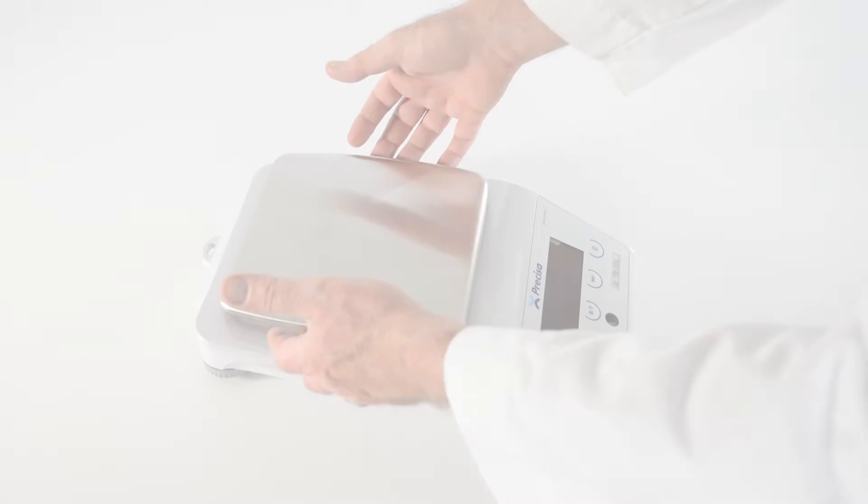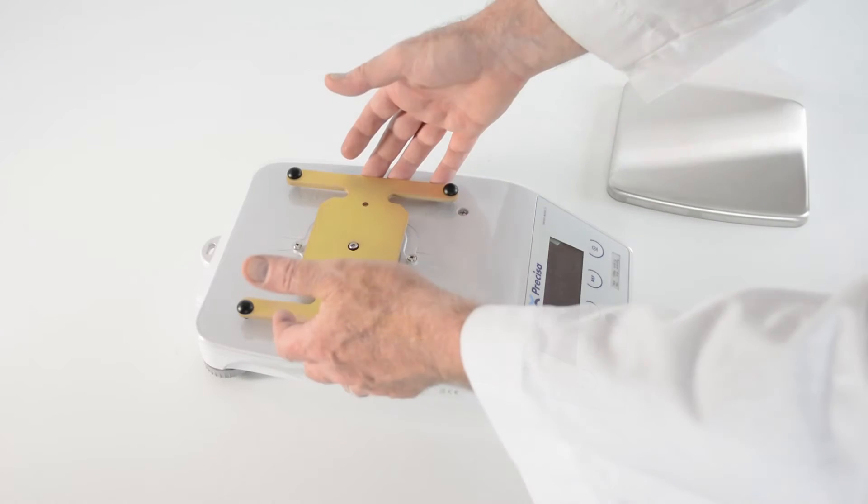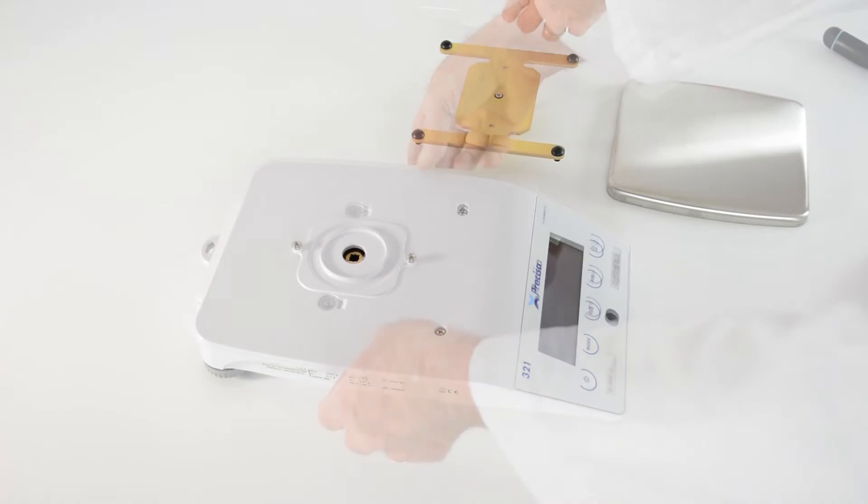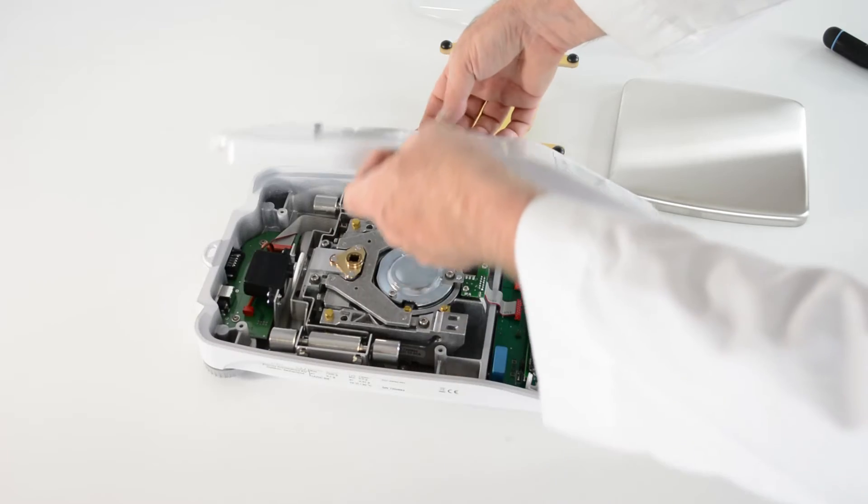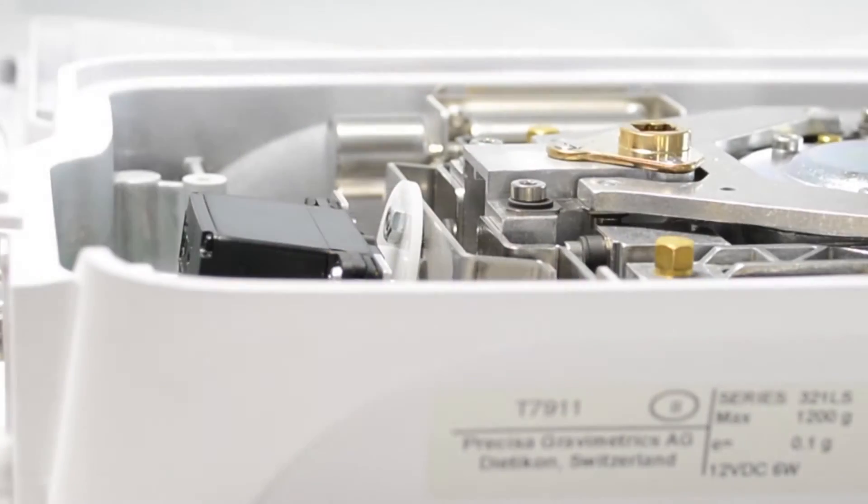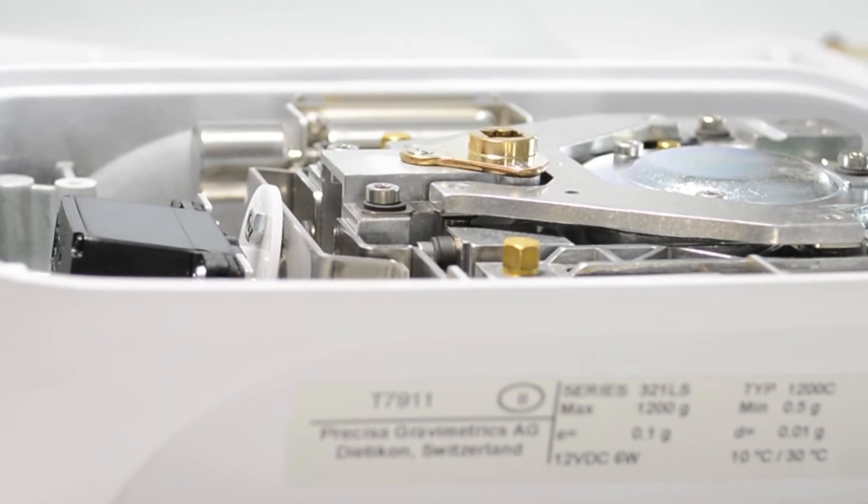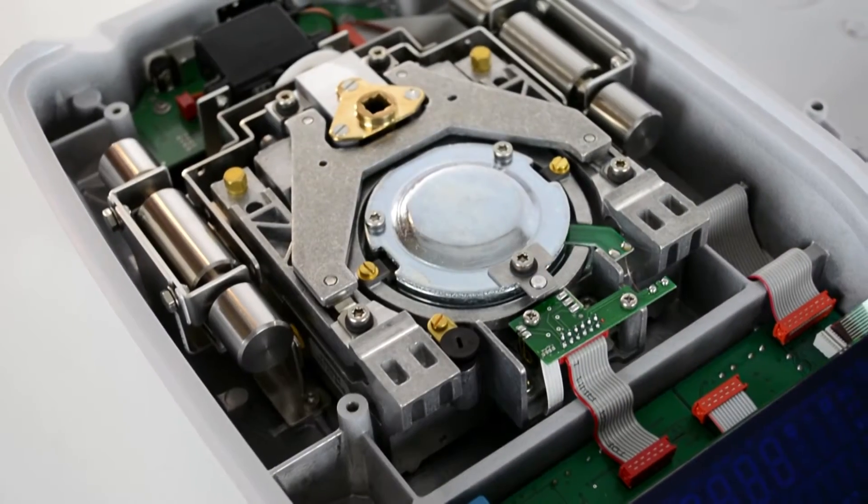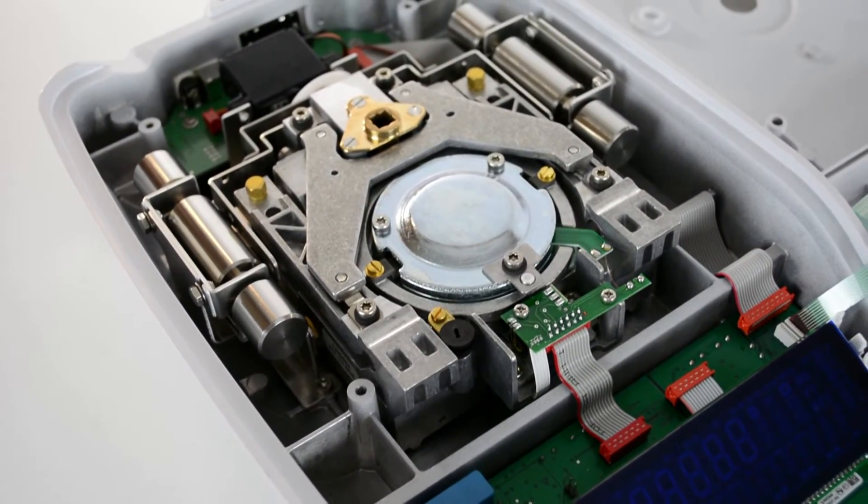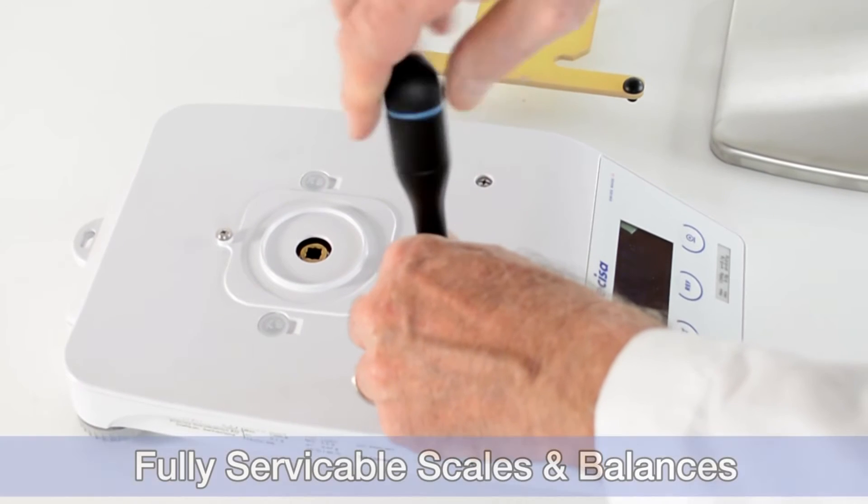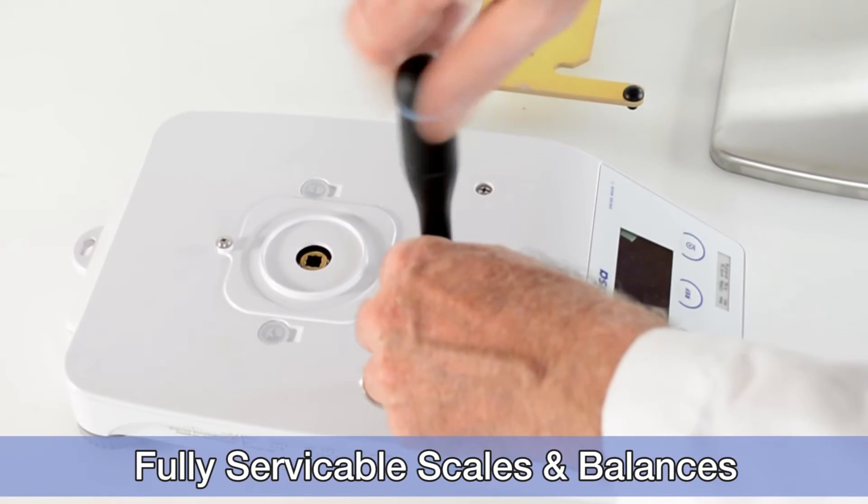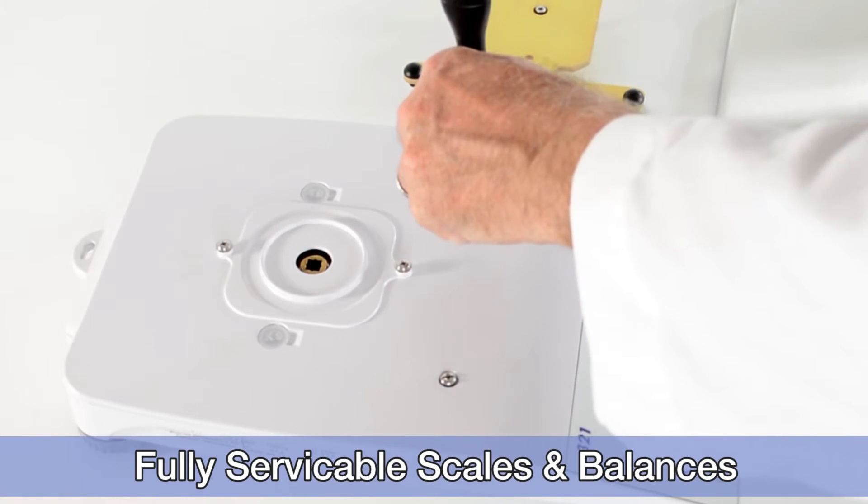Precisa balances allow more component-level serviceability in the weighing mechanism than the leading global manufacturers. Some manufacturers require the replacement of the entire weighing mechanism if damaged or misaligned by shock or overloading. Precisa has elected to maintain component-level serviceability to keep service costs low in the interest of customer satisfaction.